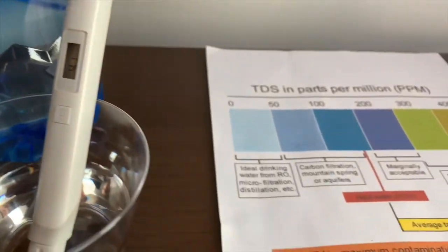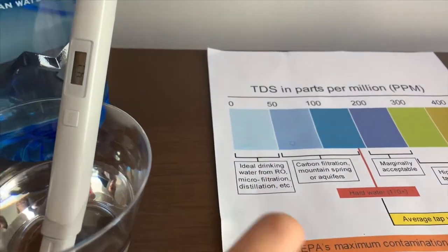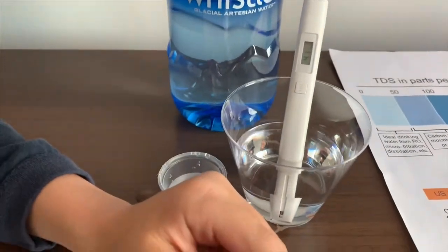42. That is ideal drinking water. Now let's test the pH level.